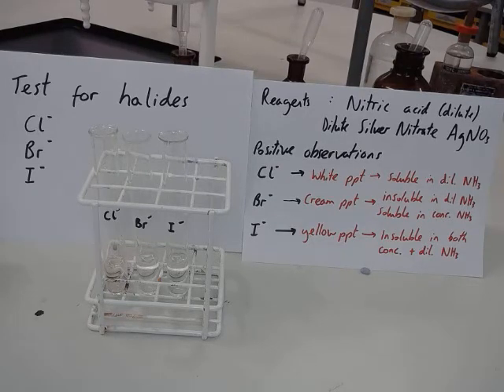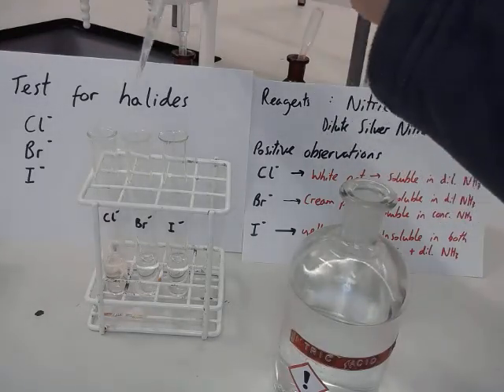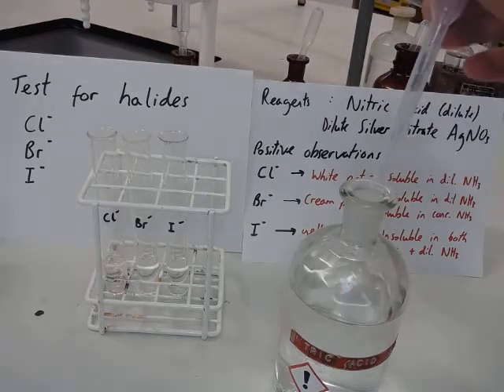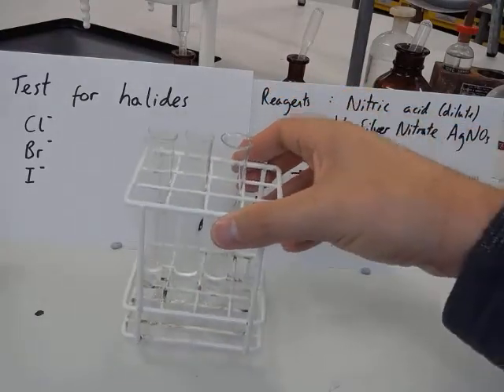So first of all, add my nitric acid to all 3. A few drops to each. Okay, there's no bubbling there, there's no carbonate, or very little carbonate if there is. Give it a little bit of a swirl.